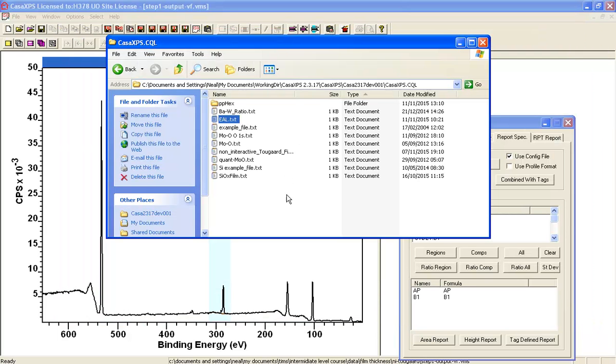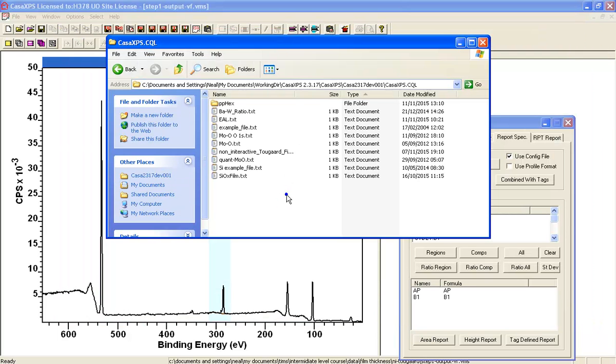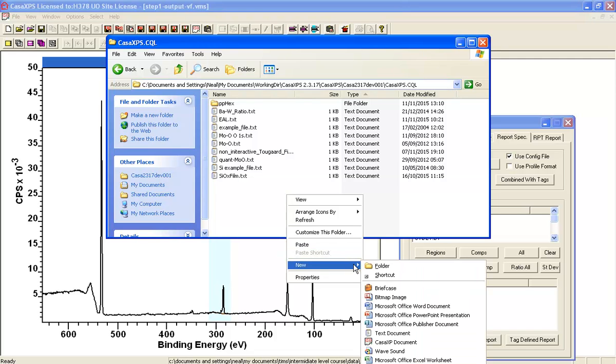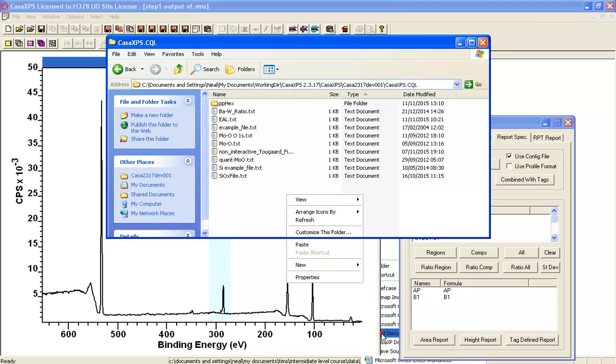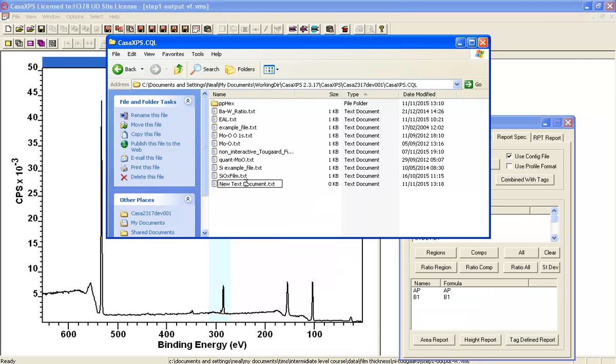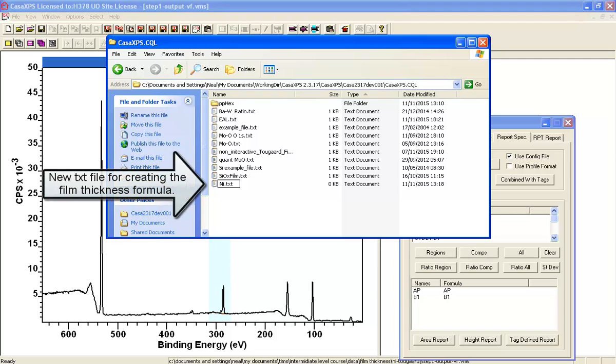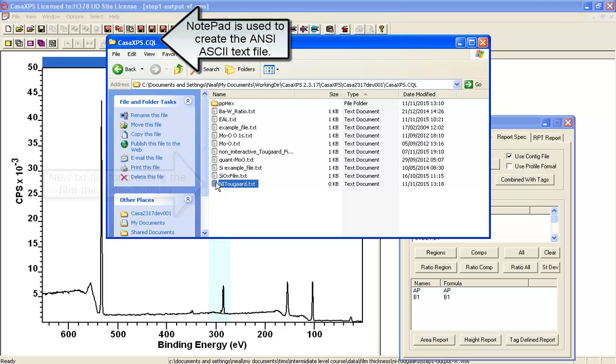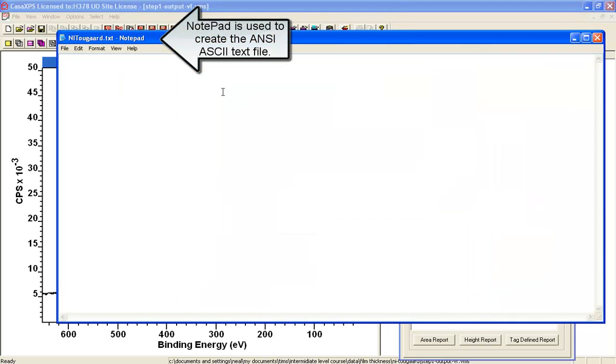We'll need to create ourselves a new file within this directory, and this new file is going to be a txt file. It's going to be the non-interactive Tougaard approach, and within this file we need to set up a definition that will lead to the calculation of the film thickness.